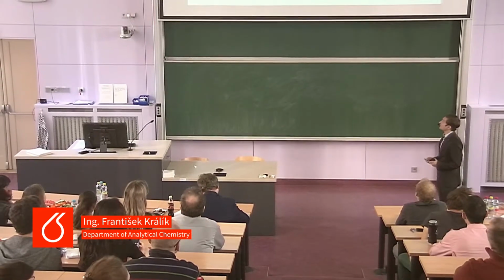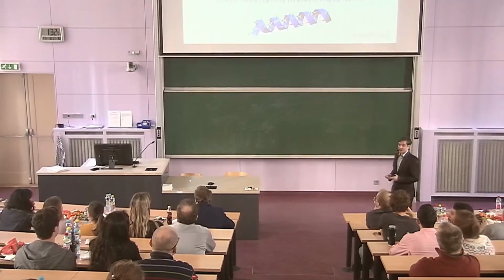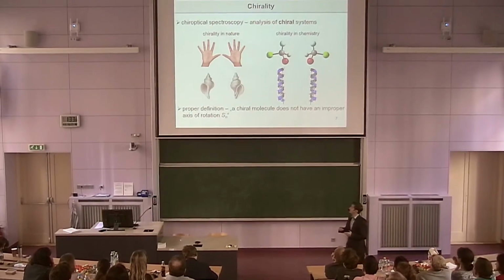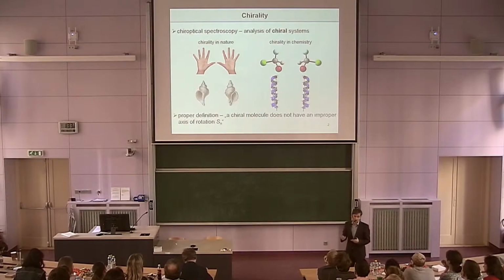Today I'm going to present to you chiroptical spectroscopy, its principles, some applications and some examples from our laboratory. Chiroptical spectroscopy is limited to the analysis of chiral systems. So first of all, I'm going to introduce the concept of chirality.